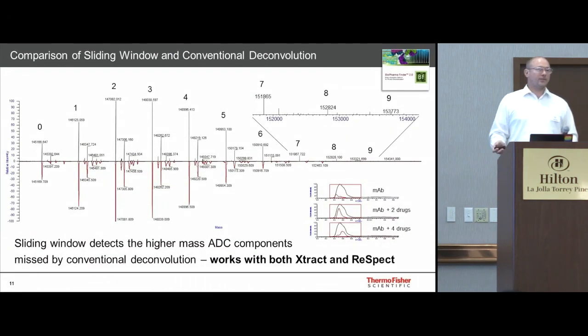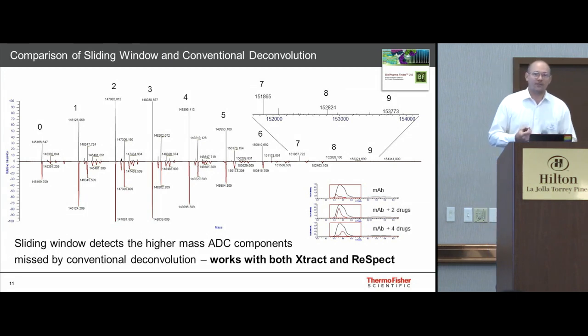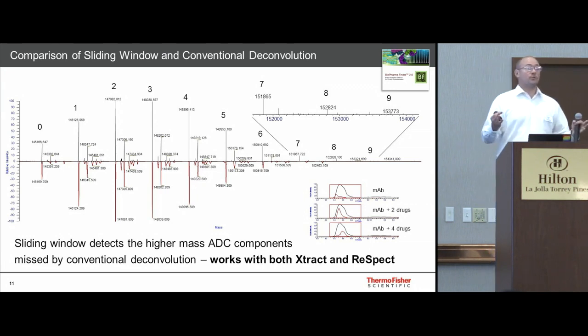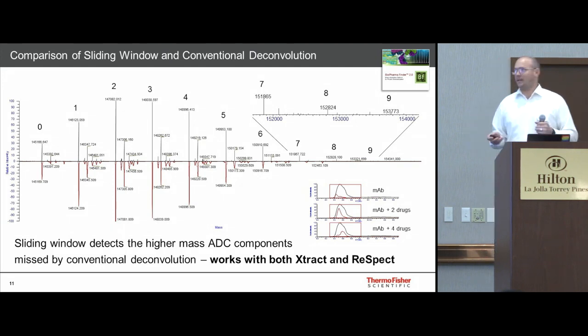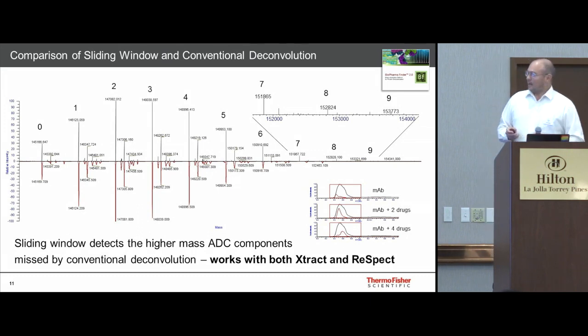You ask, what is the difference in the result? Well, the difference is twofold. The biggest difference is that we have designed a method where we are not intervening as an individual analyst. And in the end, you, me, everyone in this room could press start, and we would get exactly the same result. Once you've set up the method, it processes exactly. So there's a lot that can be done here. So batch automation is a big deal.